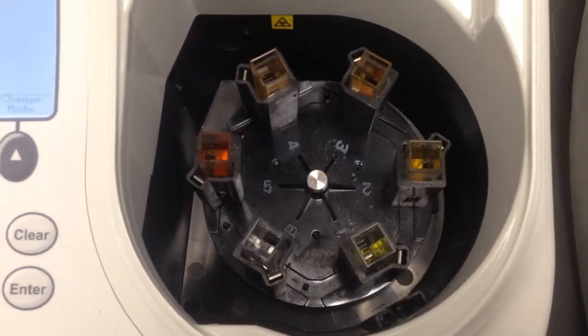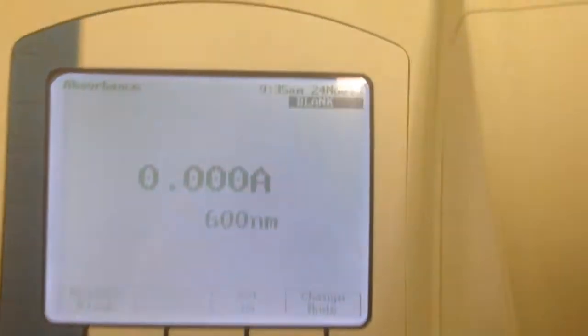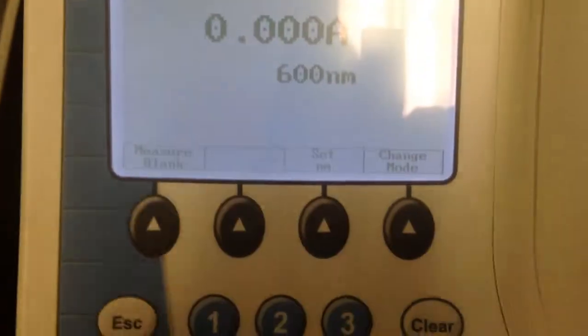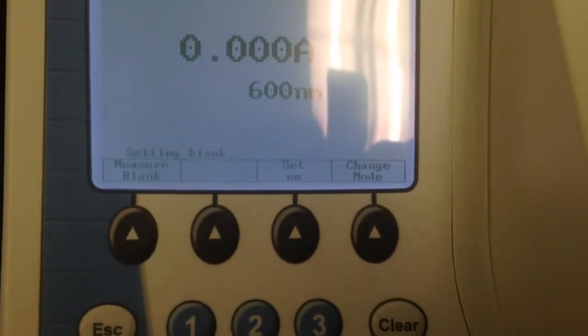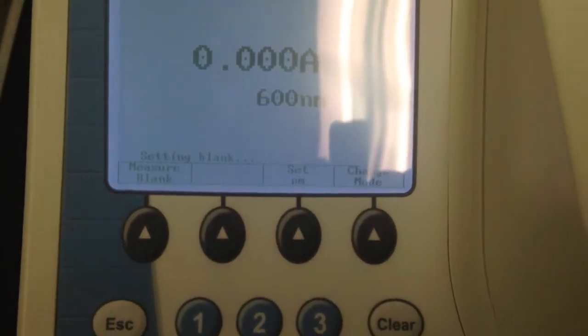Once all of your samples are loaded, select the blank sample and measure blank. This will zero out the spec to give you a more accurate absorbance of your samples.